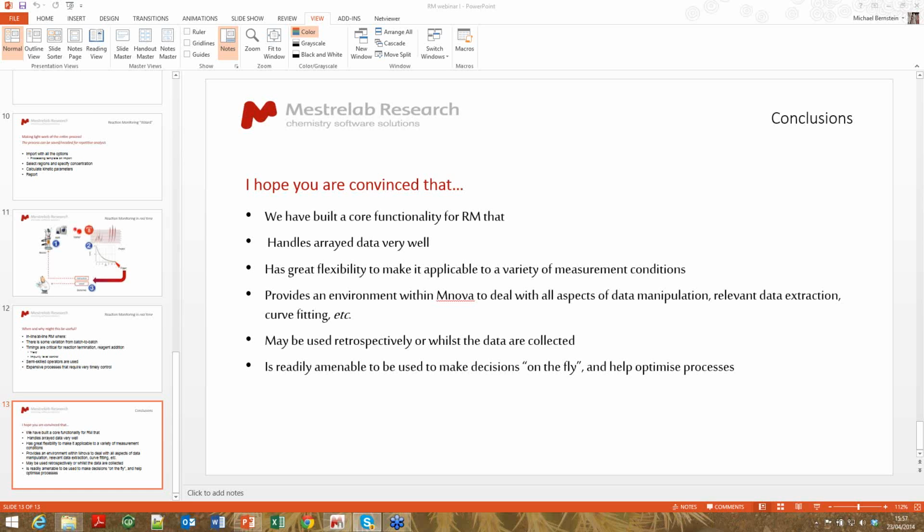Gamage has asked, can you explain more about initial concentration? Okay, that's just to say that it's often the case when you start your reaction, you know the amount of your reactant that you've put in. So you know that you put in 3 microliters of it, and the total volume is 550 microliters. So you can do the numbers and work out what the initial concentration is. That's the initial concentration of a species, normally a starting material, or initial concentration can actually be final concentration as well if you choose it to be the last one, and this comes to completion.